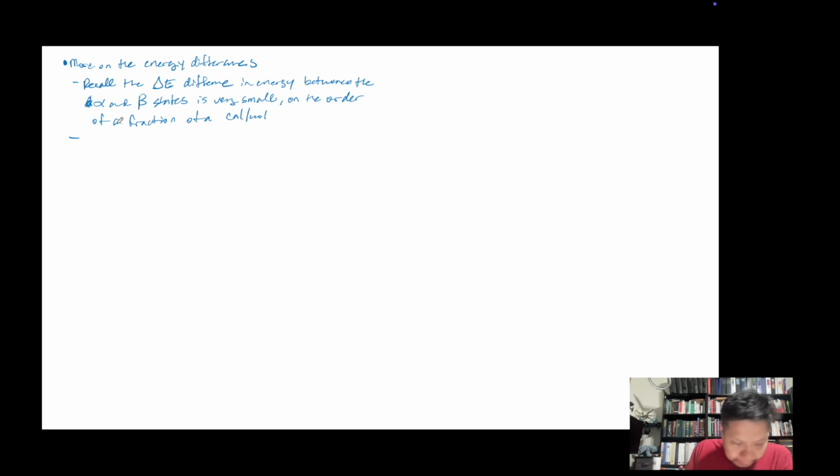What that means then is that we can define a Boltzmann population of the alpha and beta states. PChem, come back in here. Thermodynamics, right? Boltzmann population. You should remember that from PChem, and how you can have different microstates, which are all the possibilities of the different states of all the particles, right? So this is what we're doing here. And so what we can then do is get the Boltzmann distribution.